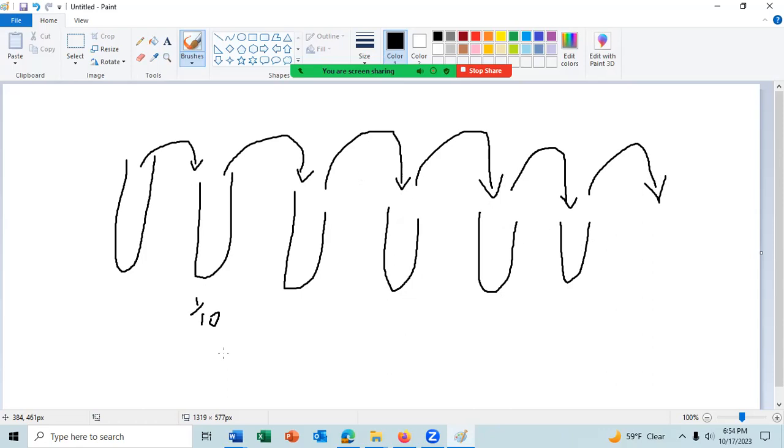He would then plate each of these in 10 test tubes.